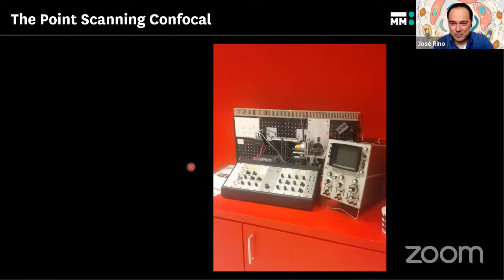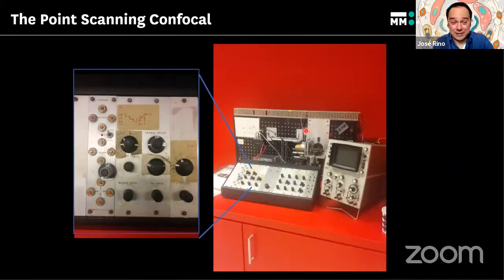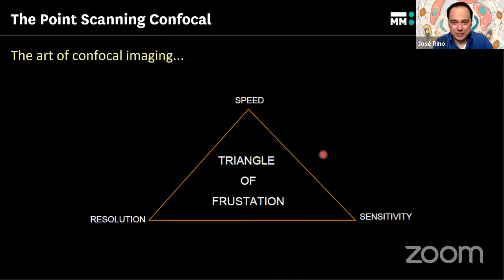So when you're using a confocal microscope and think that the software is maybe a little bit too complicated, it's actually got easier with time. Okay, this is one of the earlier confocal designs, and you have all of these controls to adjust the image that you'd see here on this oscilloscope screen. This was fully functional until a few years ago. You could still take a sample there and use it.